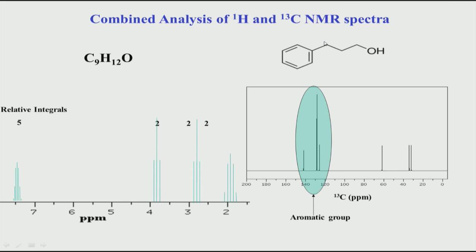The protons, this one which is here will be more downfield shifted relative to this, because of the electron withdrawing group of this, okay, and that is this peak here, because it is coming in at 3 ppm, it is downfield shifted, and there is a triplet here because this is coupled to 2 protons here. So, according to the n plus 1 rule, these 2 protons will be equivalent, they will have a triplet multiplet from J coupling, and this proton is downfield shifted because of the OH that is coming from here.